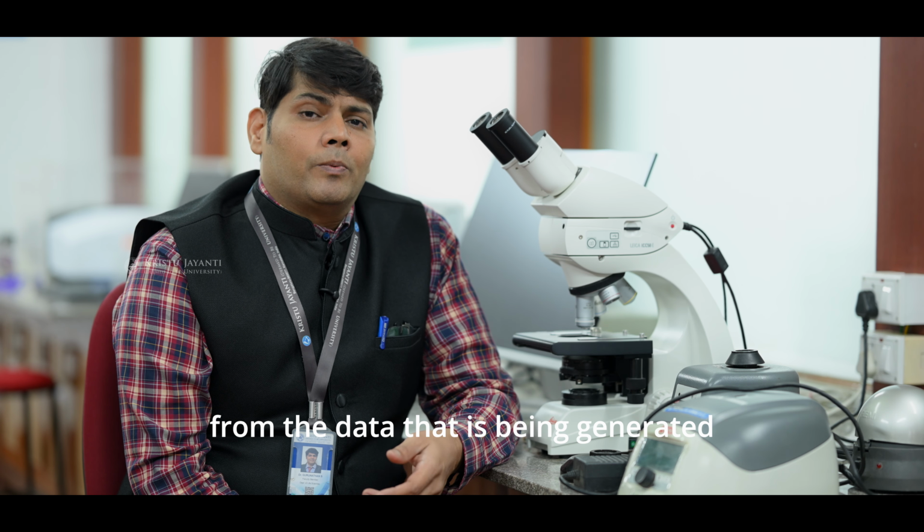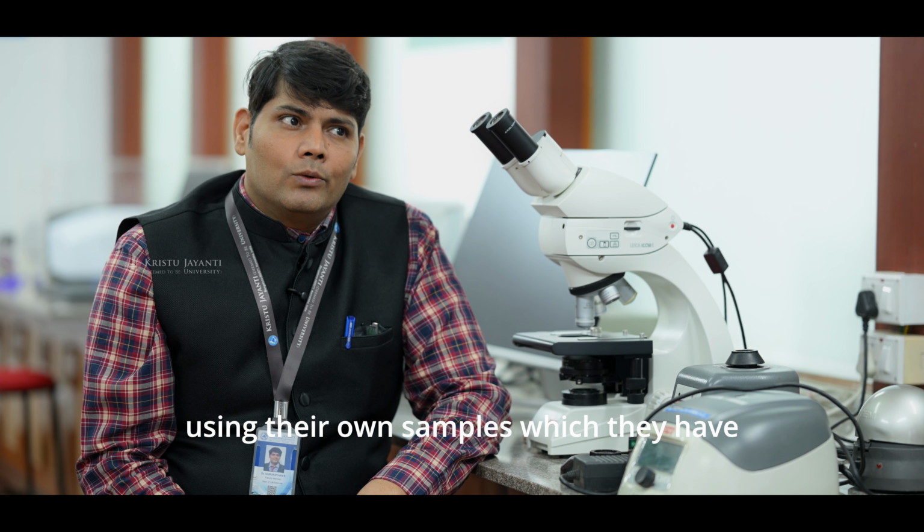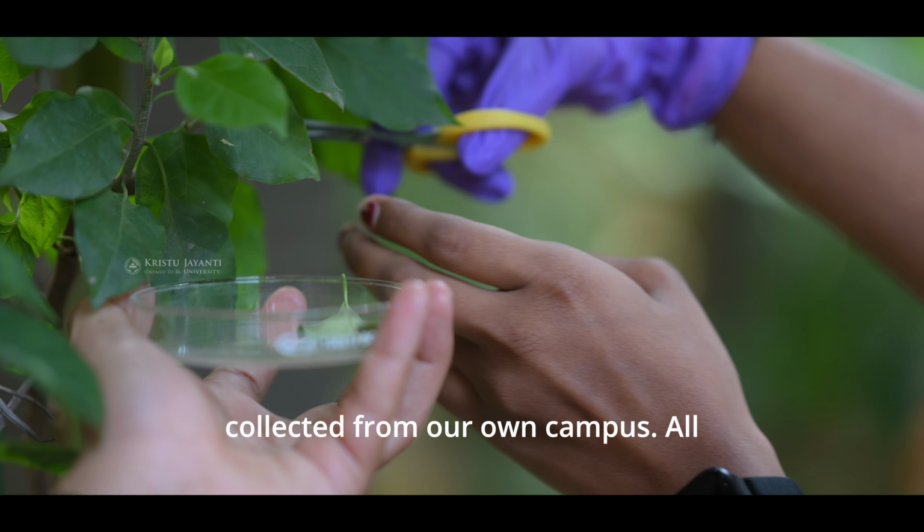Not only this, the students have also been exposed to DNA sequencing techniques and methods so that they will realize how exactly the DNA obtained from the plant samples is studied to determine the evolutionary relationship existing between different members. In addition to understanding the molecular phylogeny, the students are also taught how to submit the sequences that they have generated using their own samples which they have collected from our own campus.